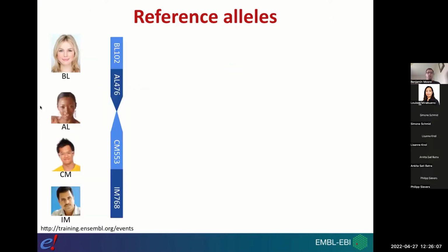The final thing that I wanted to mention is the definition that we have around the different alleles of variants. I just want to remind you of what Louise was telling you at the very first presentation in yesterday's workshop. When we're thinking about human, we have a single haploid reference genome that's meant to represent everyone on the planet. Obviously, we know that the human genome is what we think of as a hybrid or a composite genome, where the different contigs are the actual genome sequence that have been sequenced from different individuals.